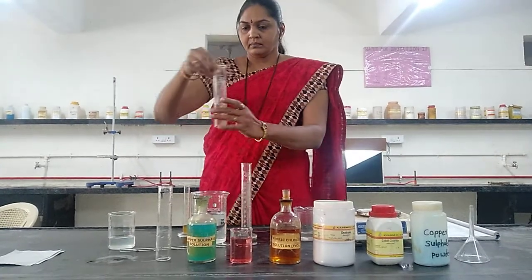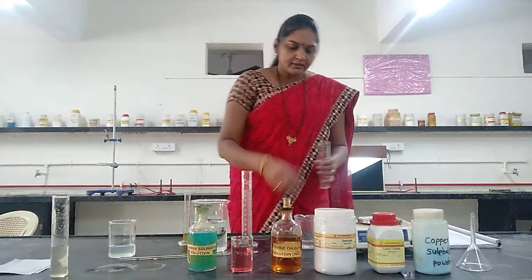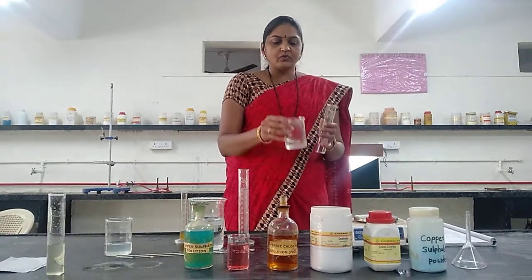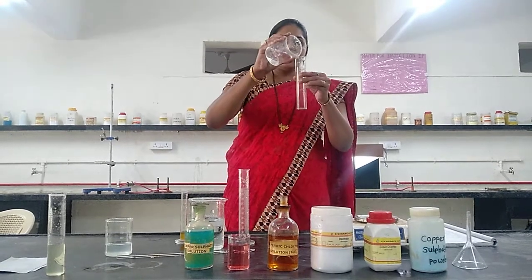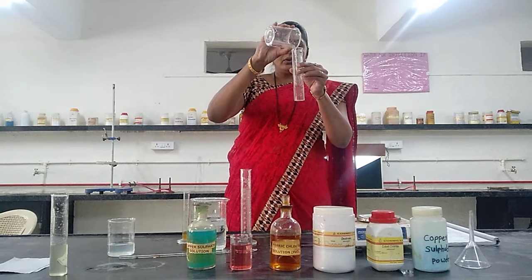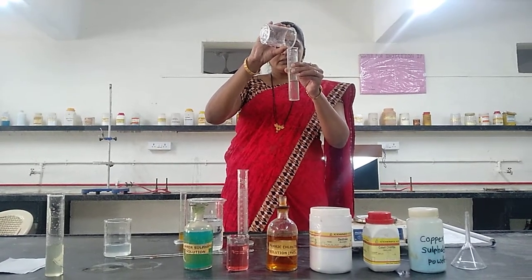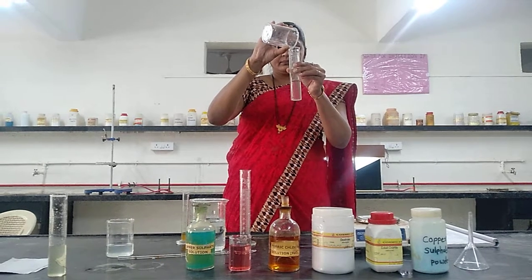This is the standard one. In the test, dextrose 25 gram is dissolved in water up to 50 ml. This is the sample solution.